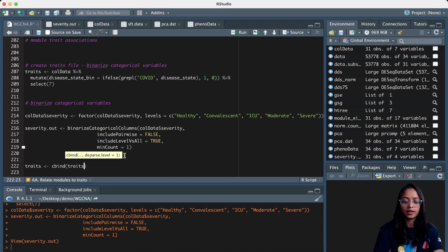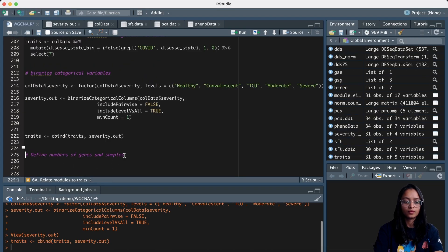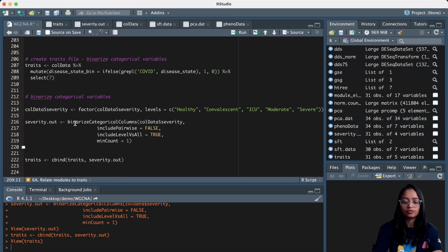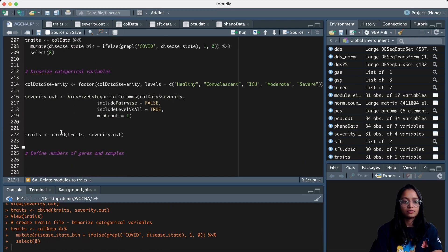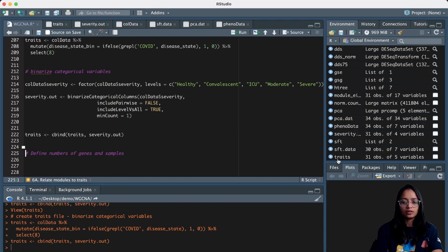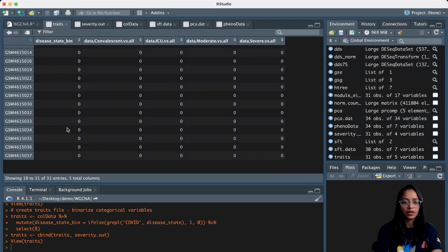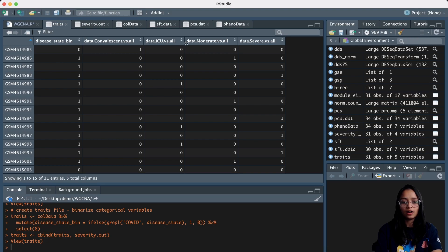Let's combine them and take a look at the traits data. We see the severity column, and it seems we chose the wrong column — instead of column seven it should be column eight, so I'm going to rerun it. Now we see, instead of the categorical column, the disease_state_bin column where COVID-19 patients are assigned value one and the rest zero, plus the severity columns we created in the previous step. This is the trait data we will use to associate with the modules.